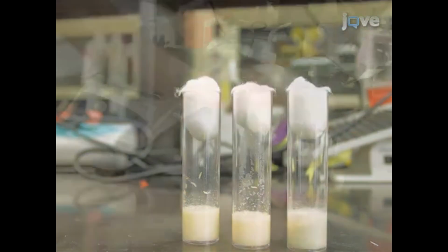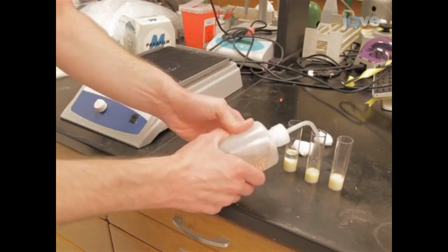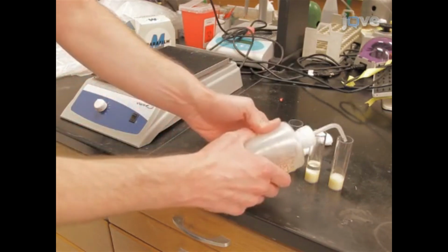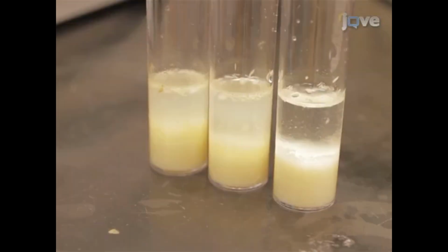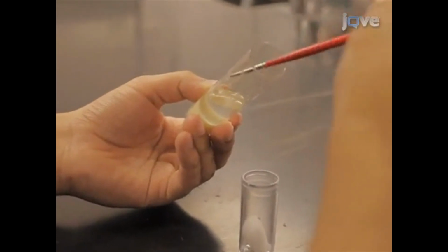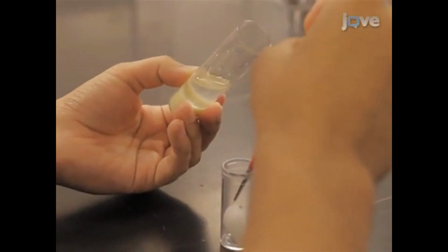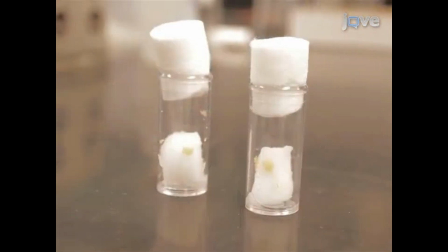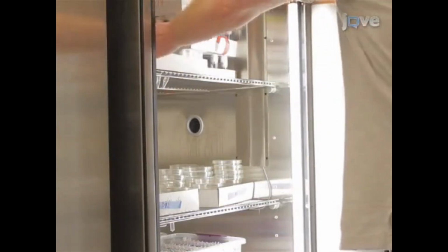To remove the larvae from the food, add approximately 5 milliliters of 40% sucrose solution to the vials, and then agitate for 15 to 20 minutes on a shaker table on a mid-range setting. After agitation, remove the floating larvae from the sucrose solution with a fine paintbrush and place them by cohort into vials containing a wet cotton plug for moisture. Incubate at the desired temperature until pupation occurs.